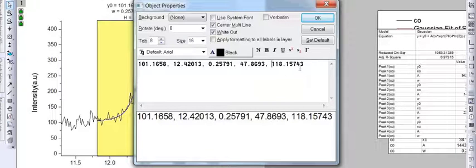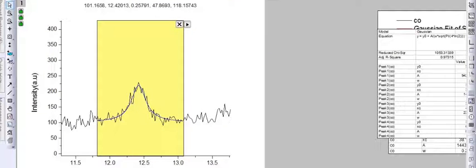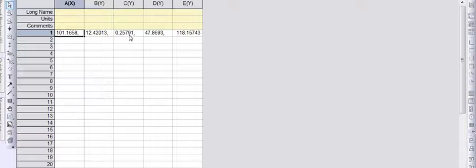Okay, now what I'm going to do is copy, and I will take a new workbook and simply paste. So here I got the values in the same way.